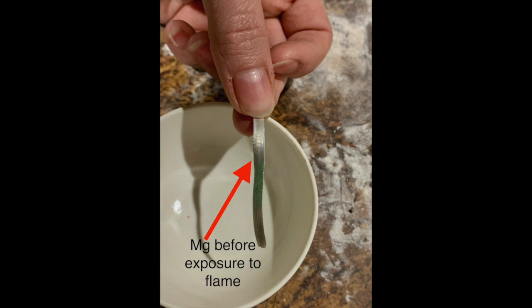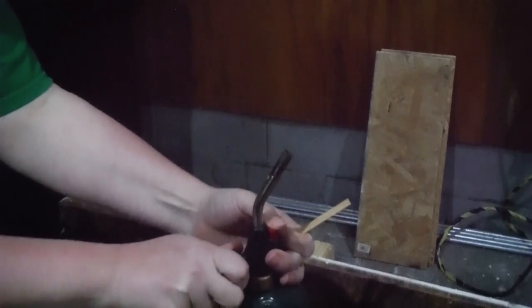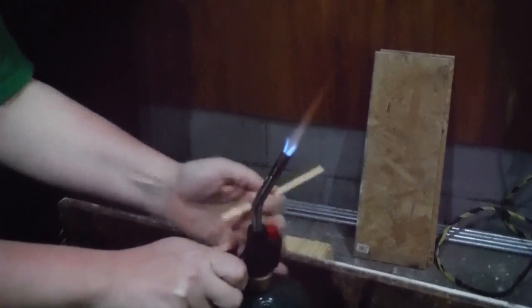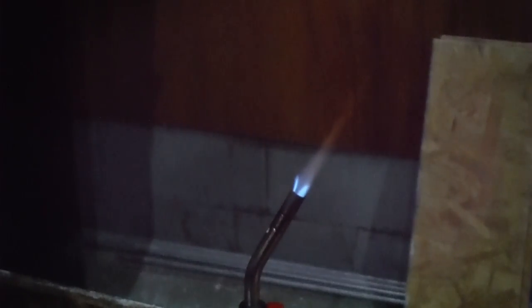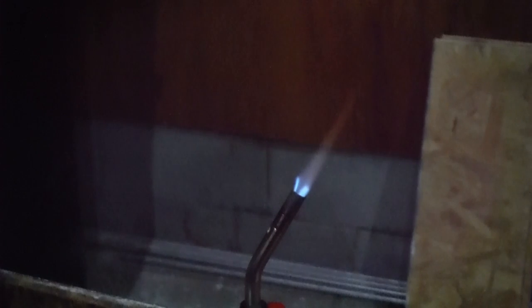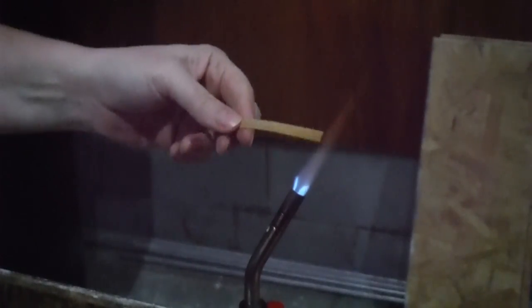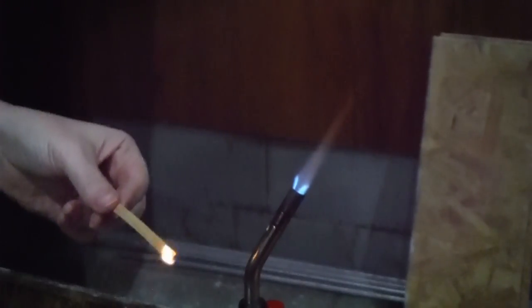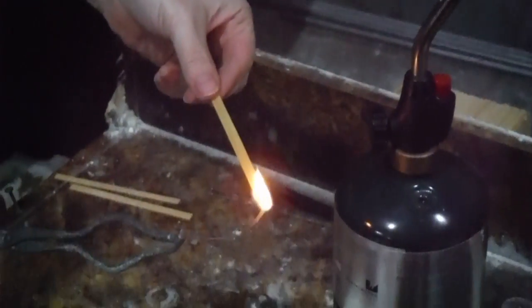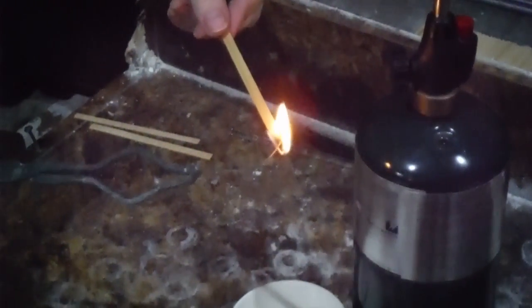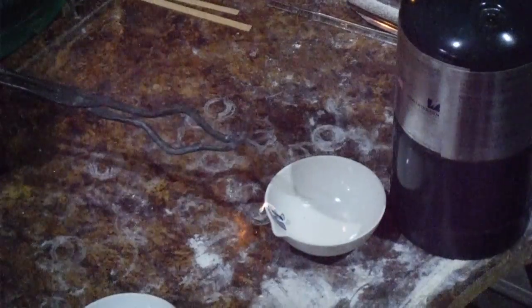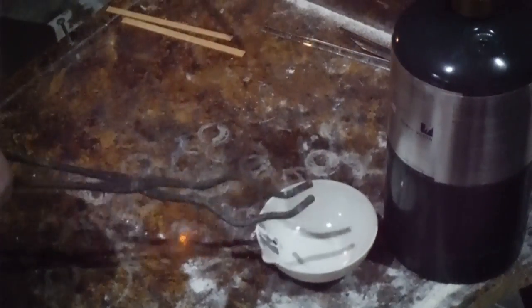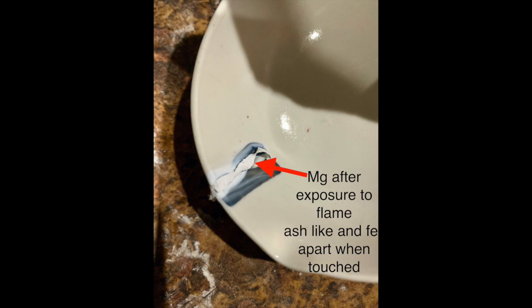So here's what magnesium looks like before you expose it to the flame. By the way, you can rewind, stop these videos whenever you need to. Here, what you see, I've ignited my very fancy Bunsen burner. It's actually a propane torch. And what you're going to see me do is ignite that magnesium strip. This is not something that normally you can watch as far as the reaction goes, because it burns so bright. It can actually damage your eyes. And what you're going to see in the next picture is the results from that experiment, what the material looks like after.